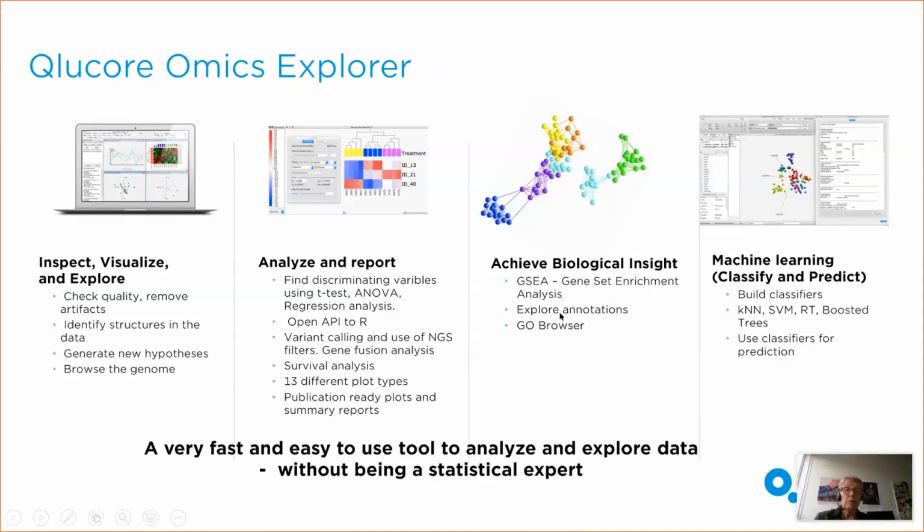The software includes gene set enrichment analysis, as well as the possibility to build classifiers using the built-in machine learning algorithms.